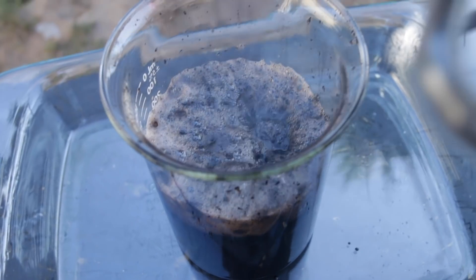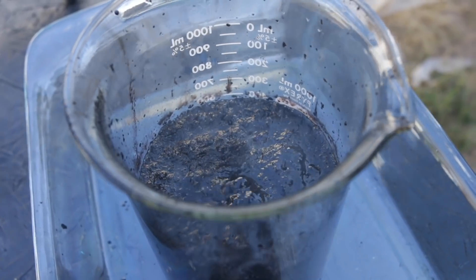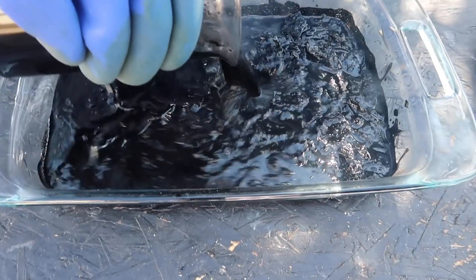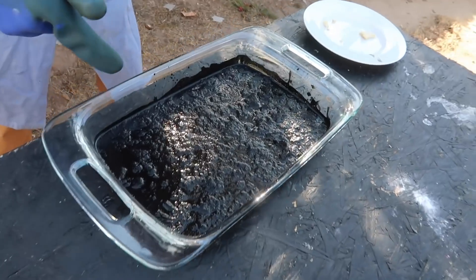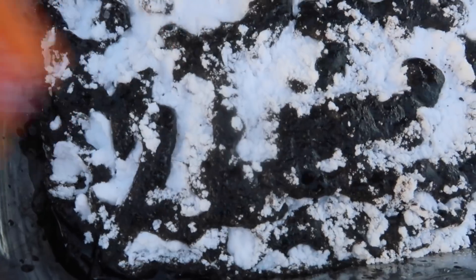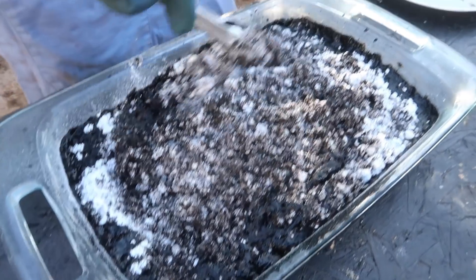It's so weird, right? Man, piranha solution is no joke. Looks like we're making a casserole. Now magically delicious.